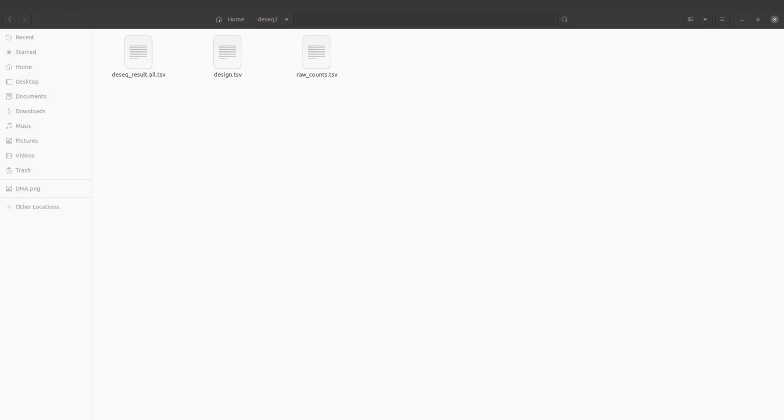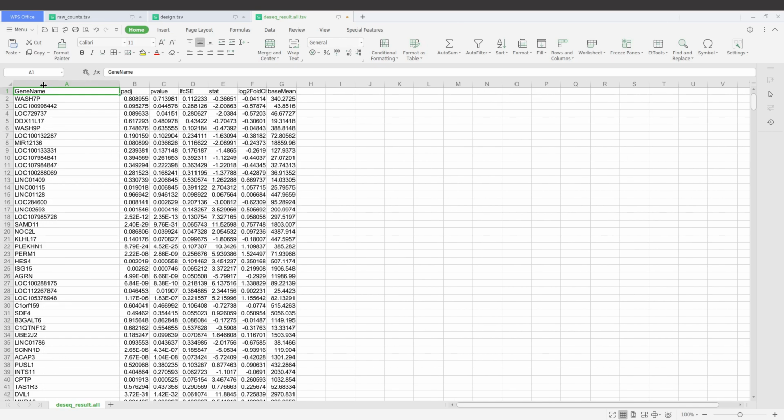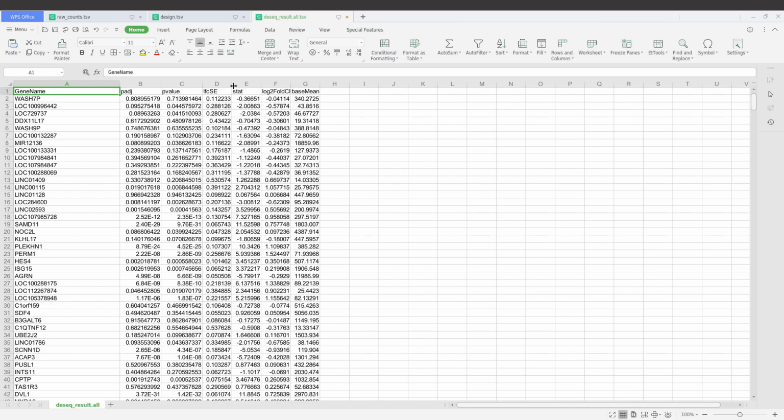So this is the output file. I'll just open it with my spreadsheet software to see the entries. All right, so we have the entries here. Okay, so everything is so cool. Okay, we have them here.